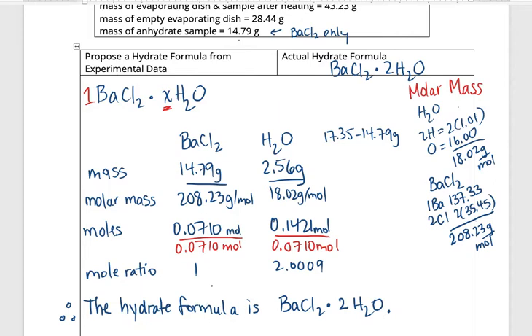And when it's not correct, you can really have a good think about why it isn't what it should be. What kind of errors happened during the lab? Why are you not getting the right water sample? Why are you not getting maybe the right barium chloride result and so forth?